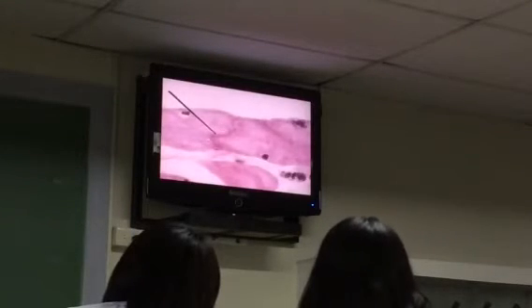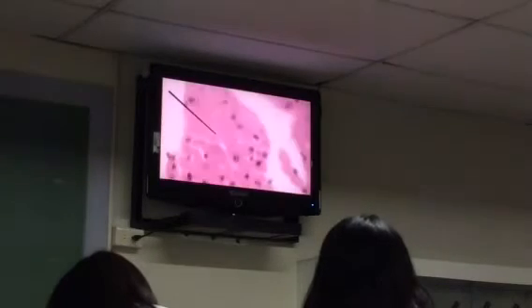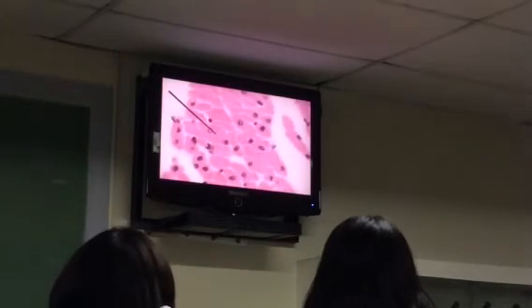Ano ang ating organ? Heart or pwedeng cardiac muscle. Anong layer at pointer? Endocardium. Specific layer or sub-layer at pointer? Subendocardium. And specific layer at pointer? What is the endothelium? Simple squamous. Di ba? Tapos ito, layer at pointer?